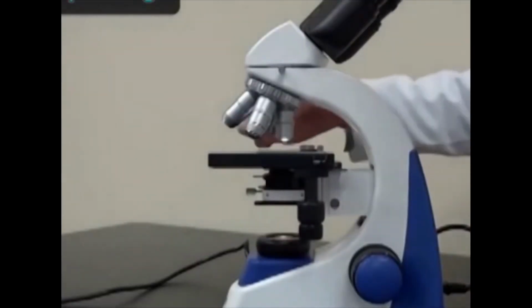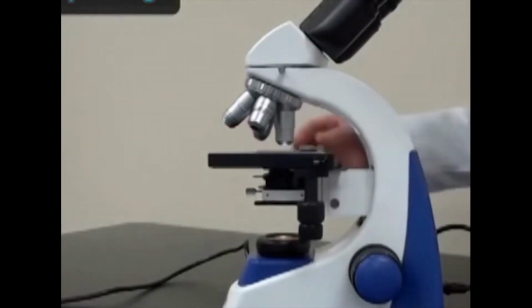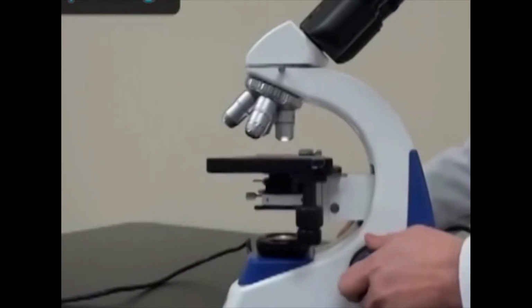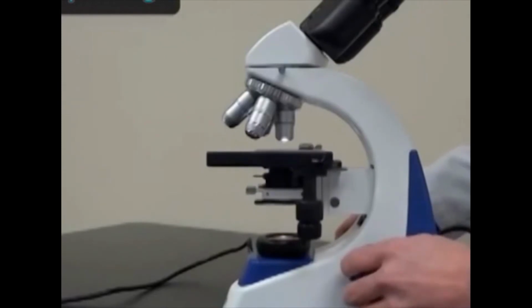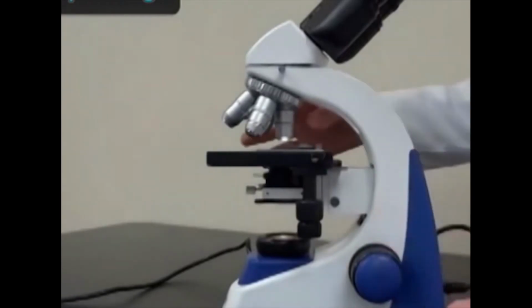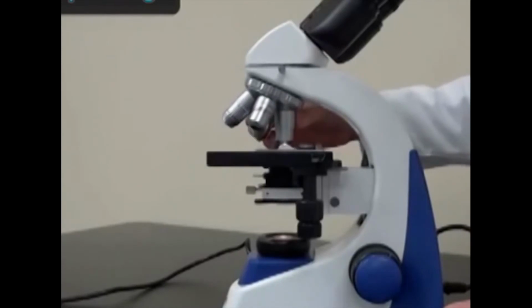In the recent types of microscopes with inclined tubes, there is a single knob on the lower part of the microscope arm with coaxial coarse and fine adjustments, and by operating this knob, the microscope stage is raised or lowered rather than adjusting a microscope tube. Coarse adjustment is effected for focusing under either low power or medium power objectives, while fine adjustment is effected only for focusing under high power objectives.